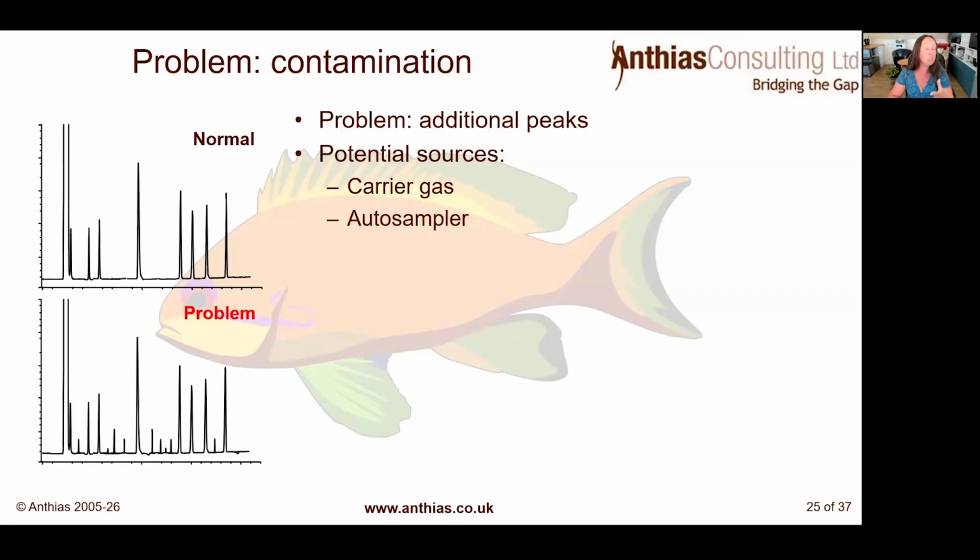If you don't know how to do that, in some software you can just put a 0 in terms of your vial number, and it knows to do a system blank. Or you can change your method so that you're doing a manual injection, and therefore it won't use the autosampler. It could also be the inlet, liner, septum, or ferrule.